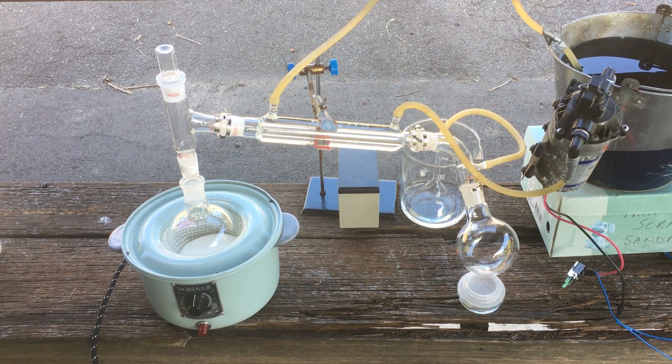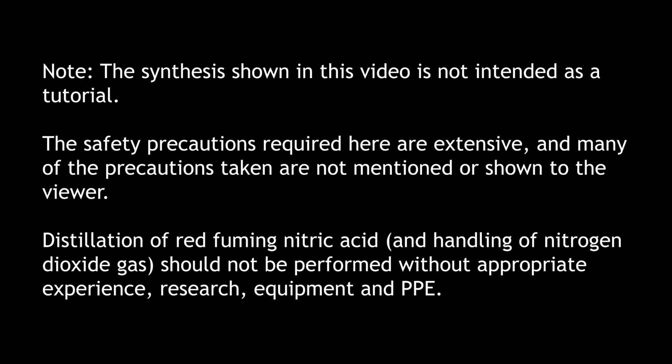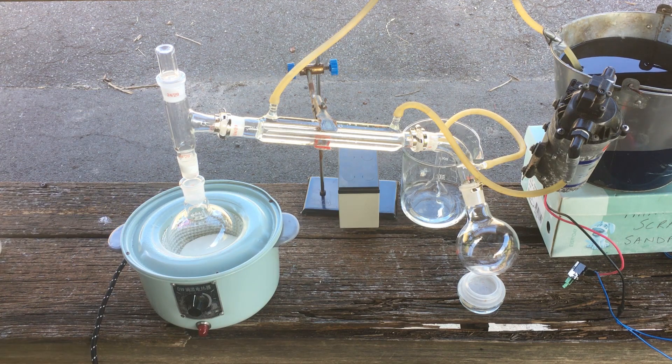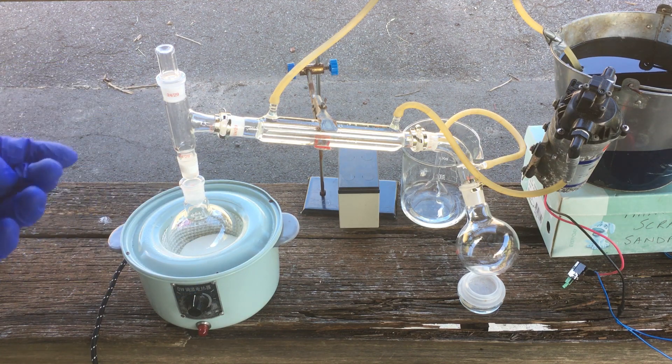Hi guys, Harry here. Welcome to Scrap Science. Last video we said we had the plan to extract lithium from lithium-ion batteries, and in preparation for doing that, the method that we've selected to use requires some nitric acid. I thought the idea of making nitric acid was interesting enough as its own video, so here we are — we're going to dedicate this entire video to making our nitric acid for our project later on.